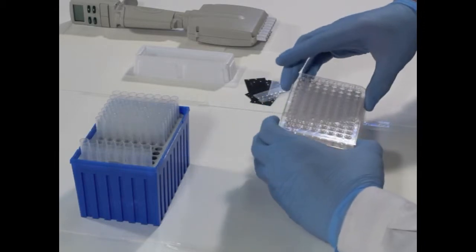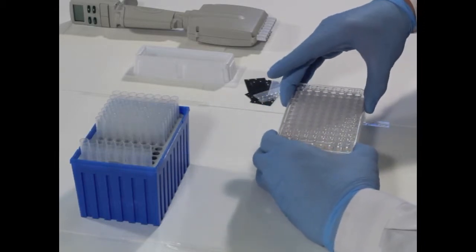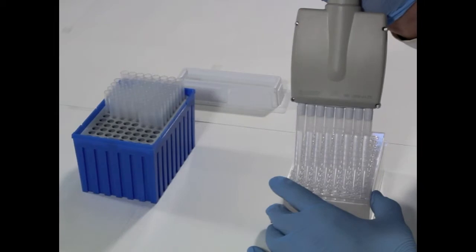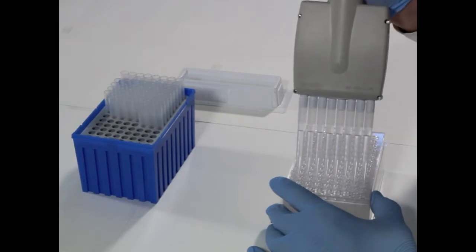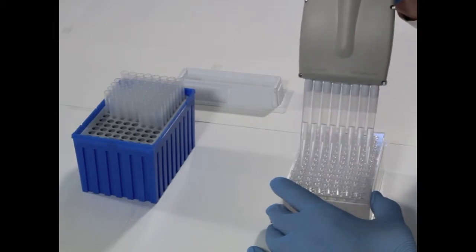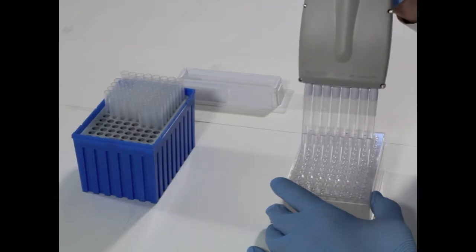The next step is to place the top plate on top of a low profile reservoir and 200 microliters of acceptor solution is added to each well.